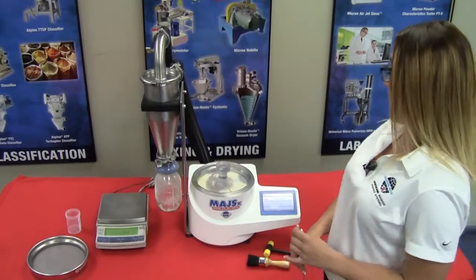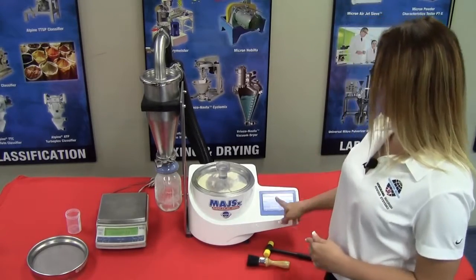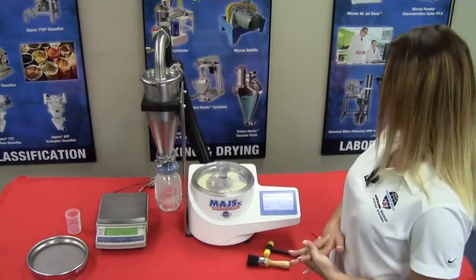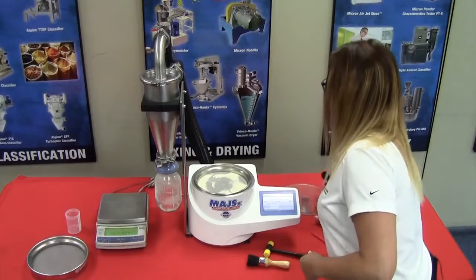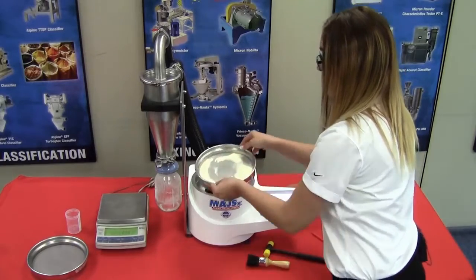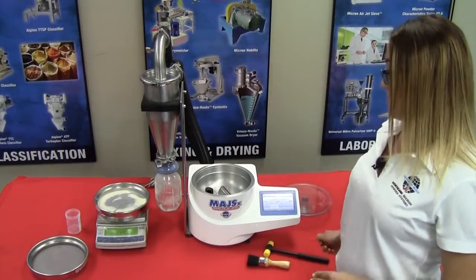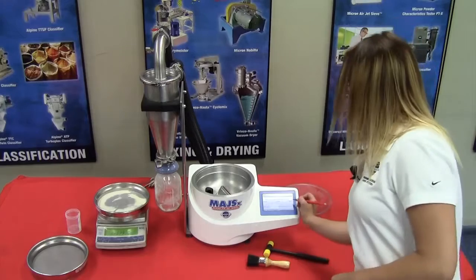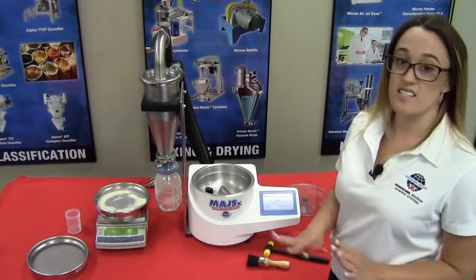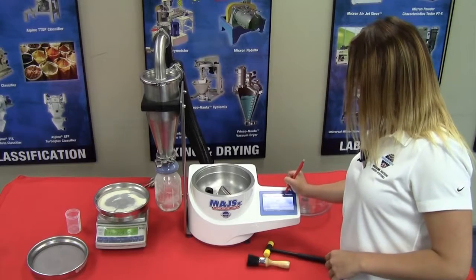The sieving's completed. Once it's completed, we're going to press next, and then it says place the 55 micron screen with the sample on the scale. Once the scale communicates with the airjet sieve, you're going to press next, and testing is completed. From here, we're going to move to the report page.